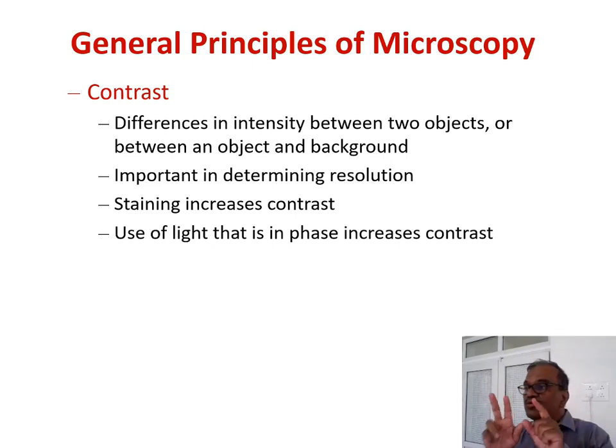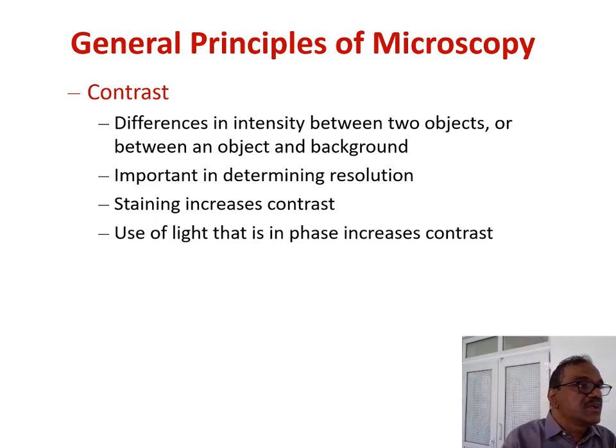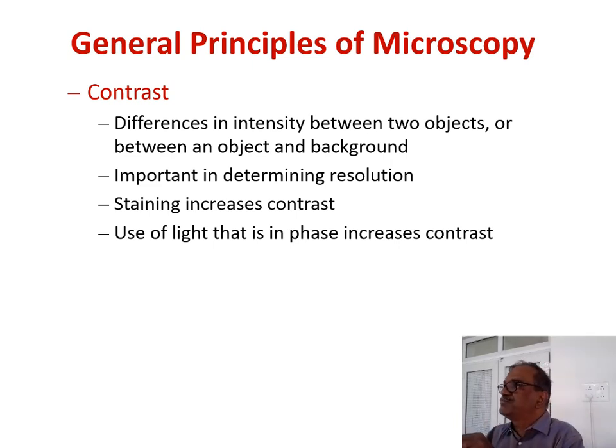If two persons are wearing the same color, then it is a little bit hard to differentiate. Same thing here: at different thickness, different diameter level or closeness, we have to find out which object is differentiated from another object at what closeness.